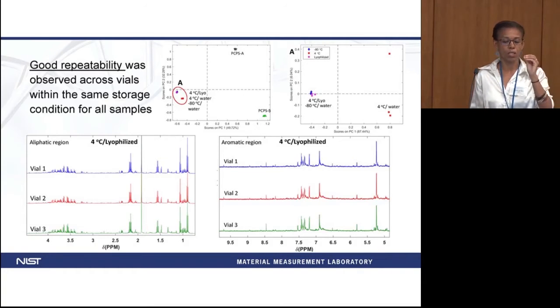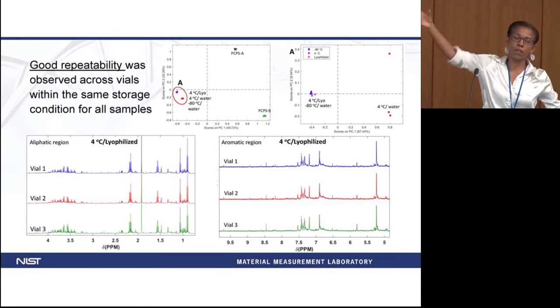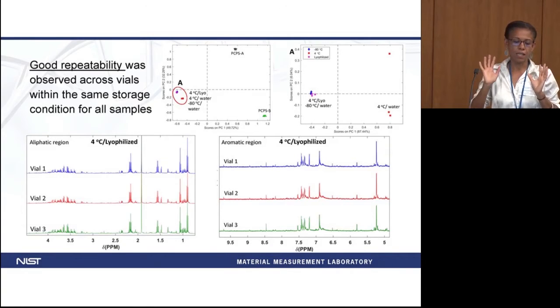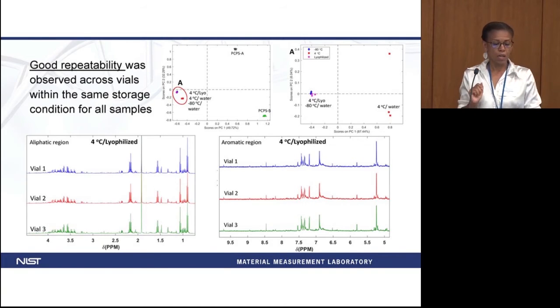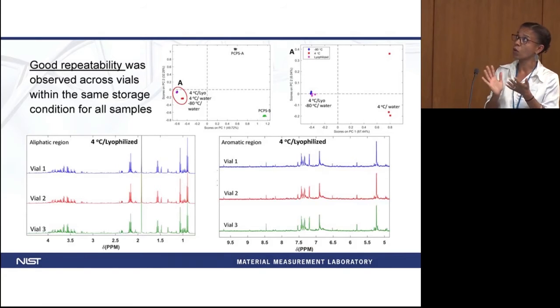for each condition of the three samples they analyzed, they were very, very close. So they are very apart, which means I think it's a little bit misleading because most of the differences that come from the buffer A and B, in fact, is related with the components of the buffer and not with the metabolites itself.